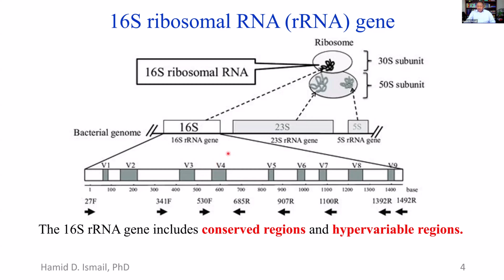And so when you use PCR, of course, we are using PCR once we have a primer. That means we will amplify this region and keep amplifying it. It will extend, and it depends on the protocol and the primer that you use. You can maybe amplify the whole gene or maybe just a portion of the gene. Okay, so this is how you do this in the lab.